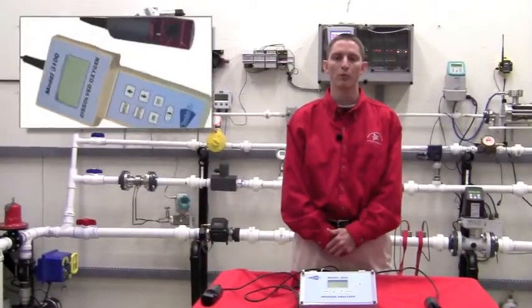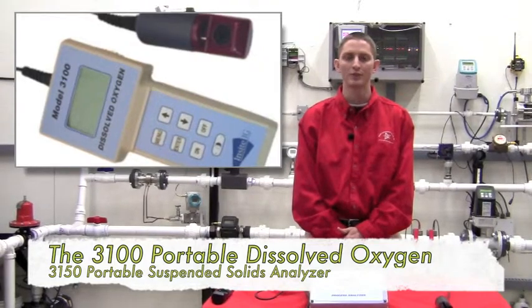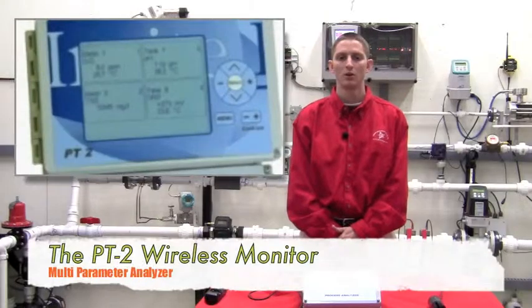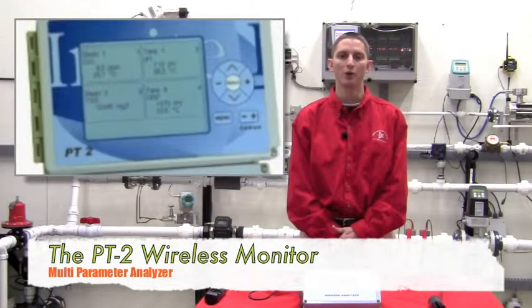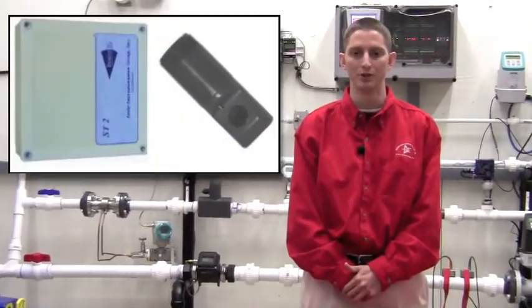We also have two portable versions — one for dissolved oxygen and one for total suspended solids — along with a wireless version. We are the only manufacturer to offer a wireless product line for dissolved oxygen or total suspended solids measurement.